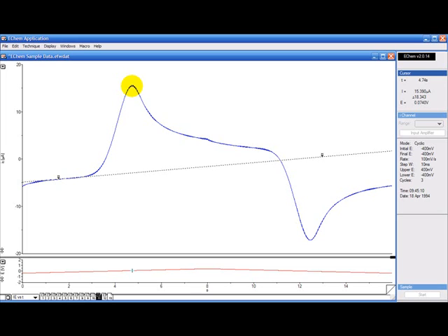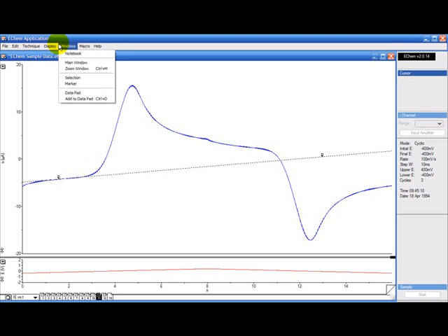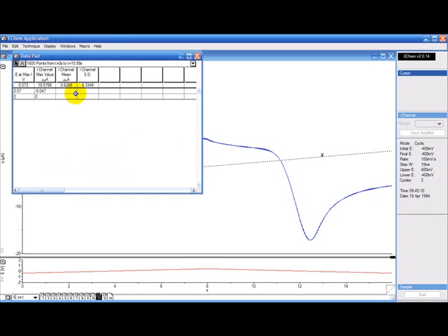If you want to record the area under that peak, you need to use the data pad which is in the windows. Click on the data pad in here.